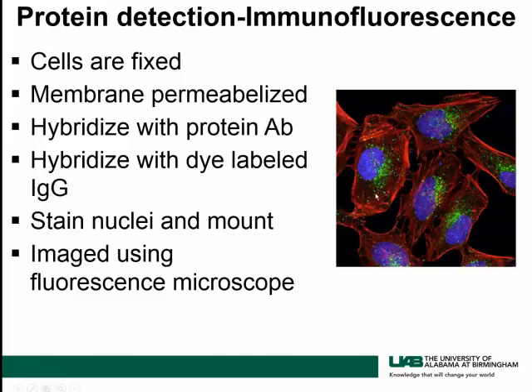Not only will you see the quantity of expression of each protein, but also the location where they're expressed. They can be expressed in the cytosol or on the plasma membrane right here. You can see the nuclei, and surrounded by the nuclei are the green labeled proteins, and then you see this cytoskeleton protein that is expressed mostly in the cytosol and toward the plasma membrane. So these are some of the really basic techniques that are used to isolate and to detect protein expression in cells.